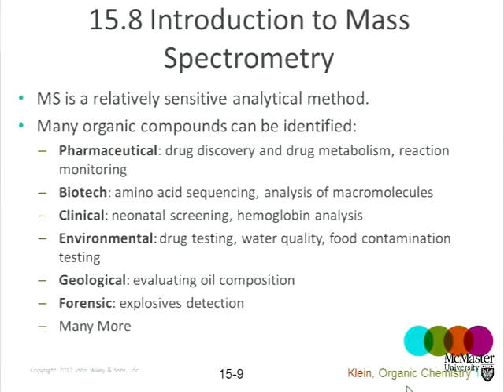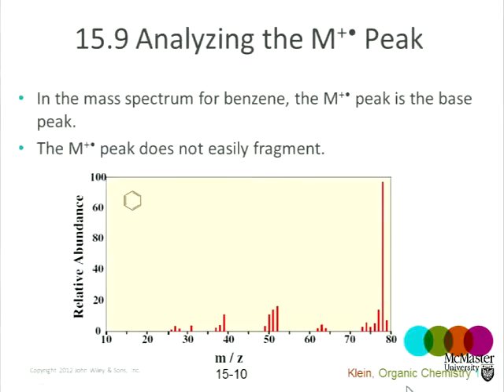So when you go to the airport and they take a little swipe thing inside your suitcase, right? I guess most people have been through that, right? They take a little cloth and they wipe it and they stick it in a big sort of square boxy machine. That is actually a mass spectrometer that is looking for compounds with the molecular weight and fragmentation pattern that are predicted for known explosives. Okay, many, many more applications.